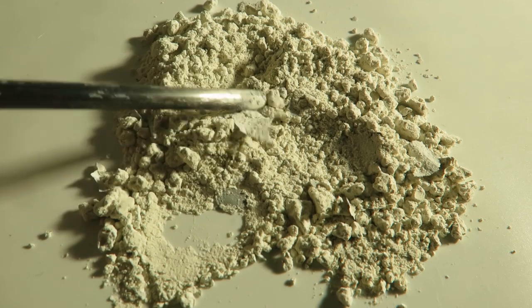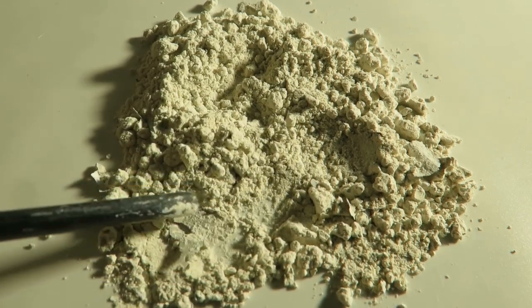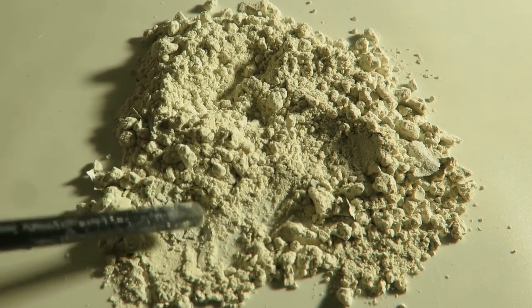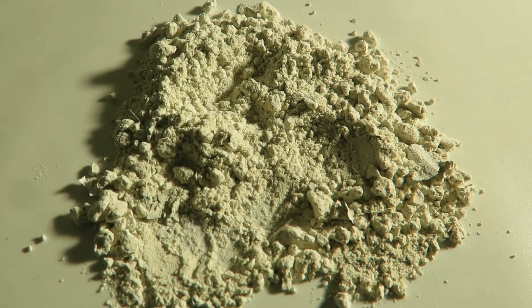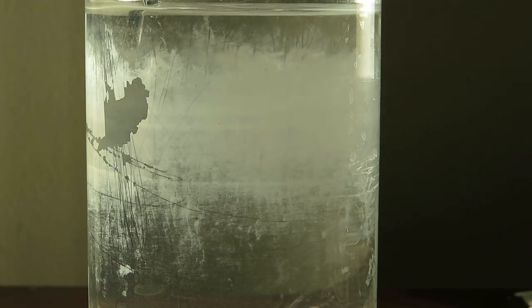After drying I ended up with a product that looks like this. It is obviously contaminated with aluminium foil, but this is from the tray that I baked it in. However, I have seen some pieces of aluminium that are obviously from the reaction itself, which I assume are from the container on the right side, but this can be screened so not a big deal.